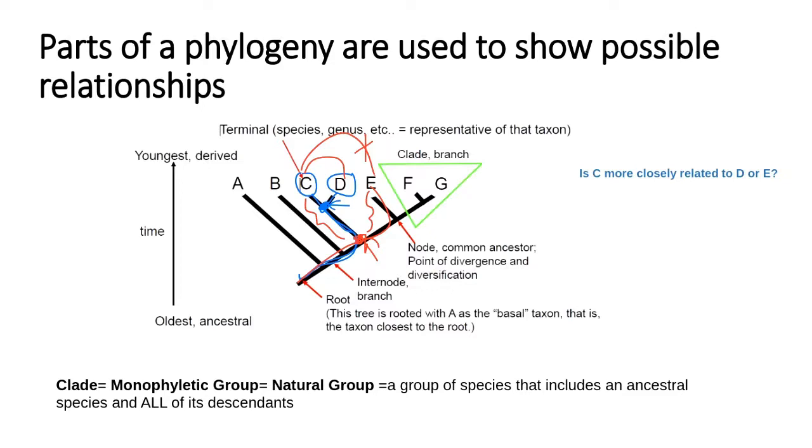I want you to explain that from your tree you can hypothesize that this particular species of a virus is related to this and this one, and it is far away from that one, although altogether they form the same clade, so they are all hopefully related somehow. So that's some kind of explanation and analysis I would want you to perform.